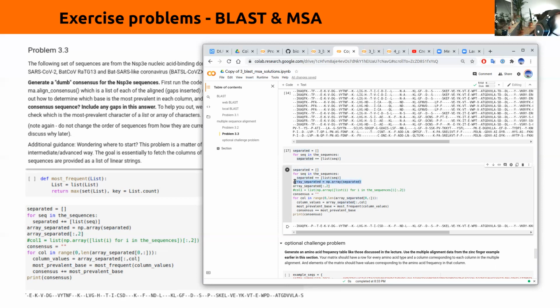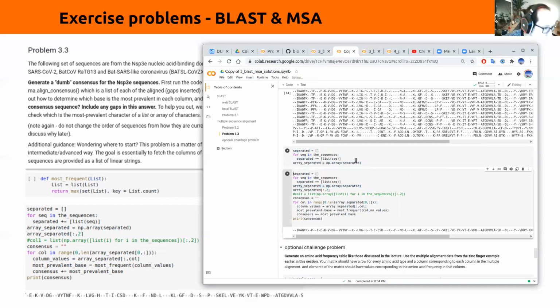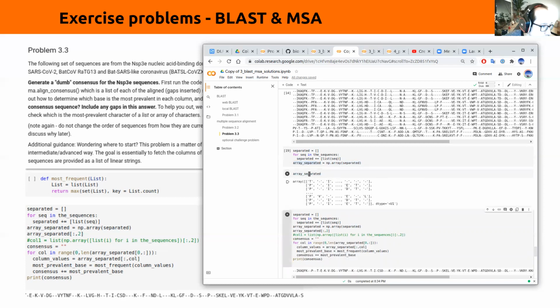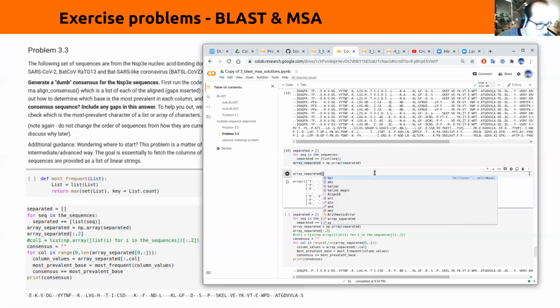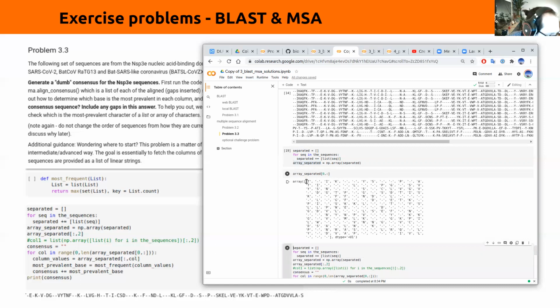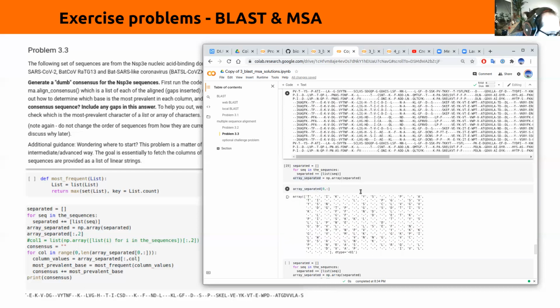So as soon as we've created this matrix, all of a sudden our data becomes much easier to navigate. If we print this out, it's being truncated here because it's huge. So we have the dots here, but we have a matrix. And we can slice through it if we want to fetch, say, the first row, all columns. We could do that. So here is one row. And if we go up to the top, we can see indeed that it is this row here, T-I-K-Y-S.